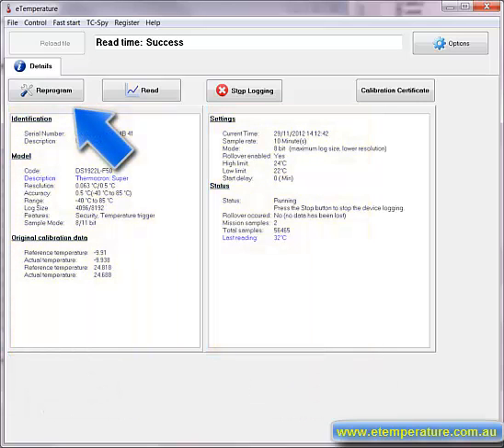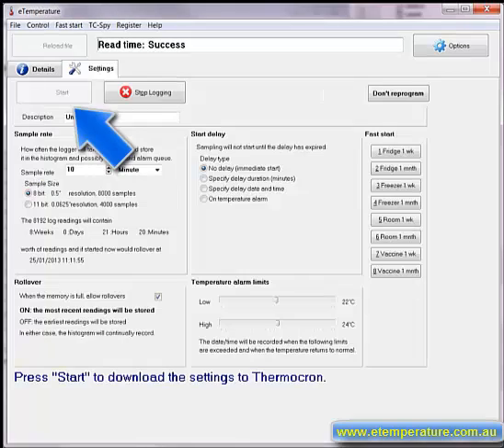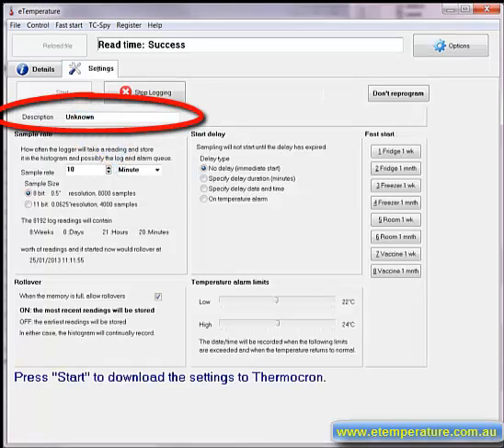Press the Reprogram button and the Settings tab will appear. There are five pieces of information that you will need to enter.